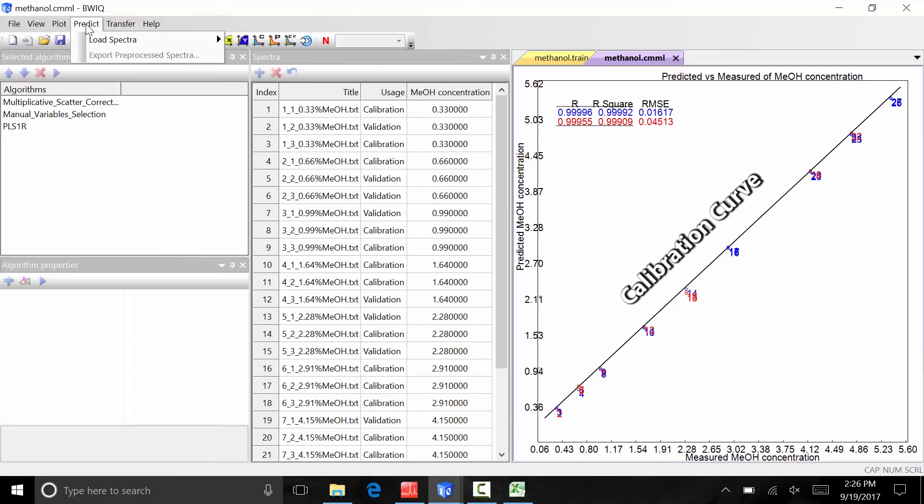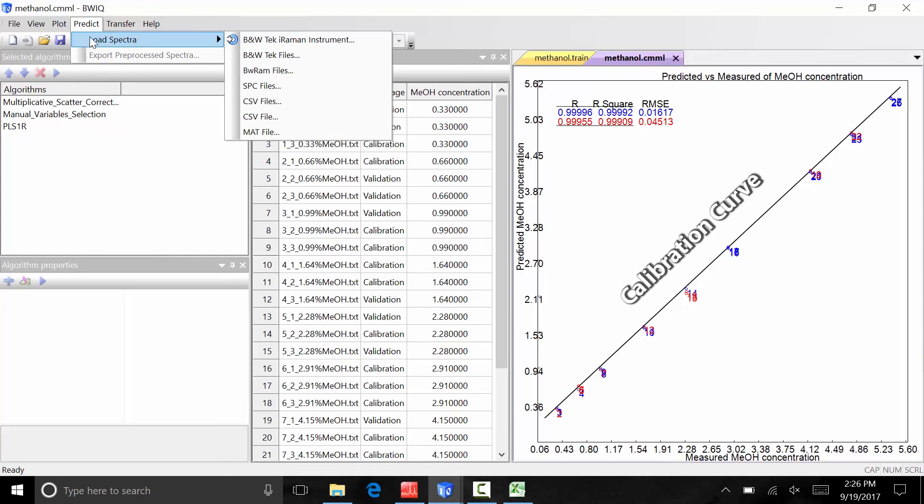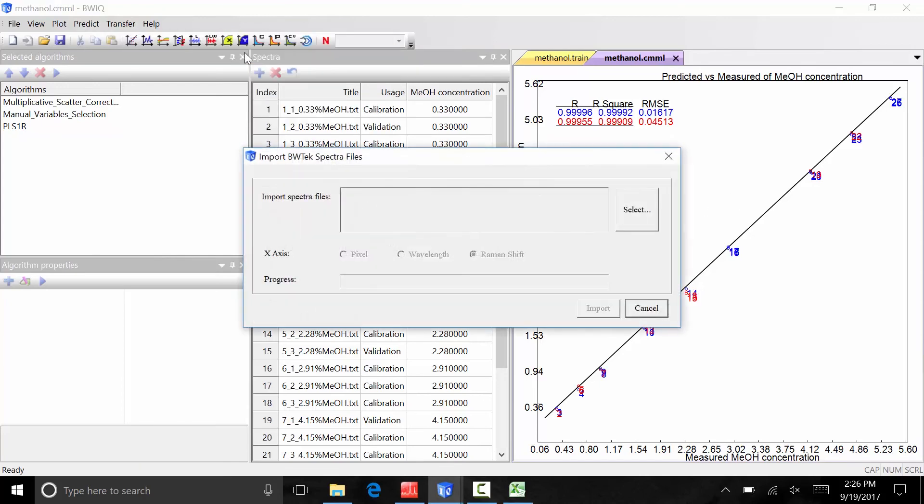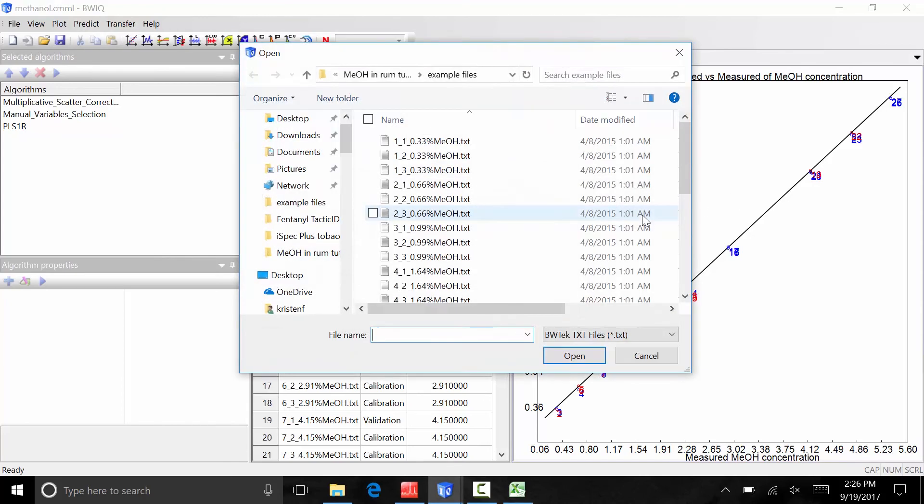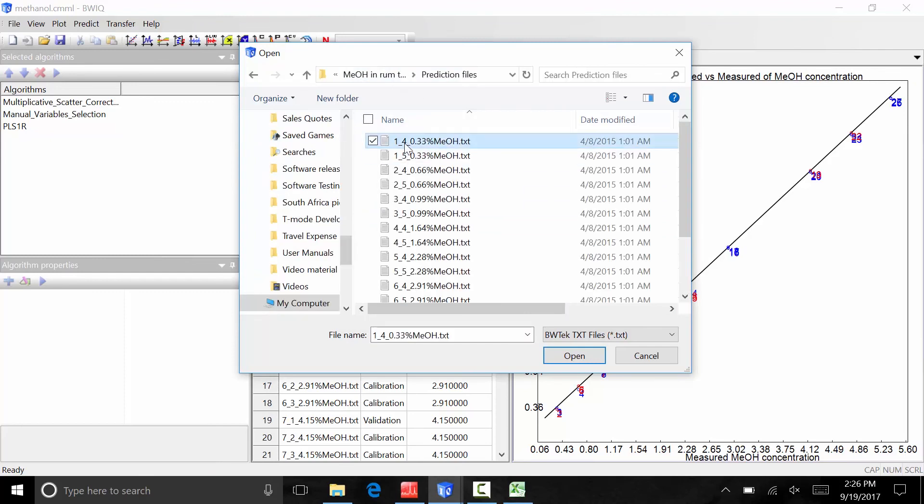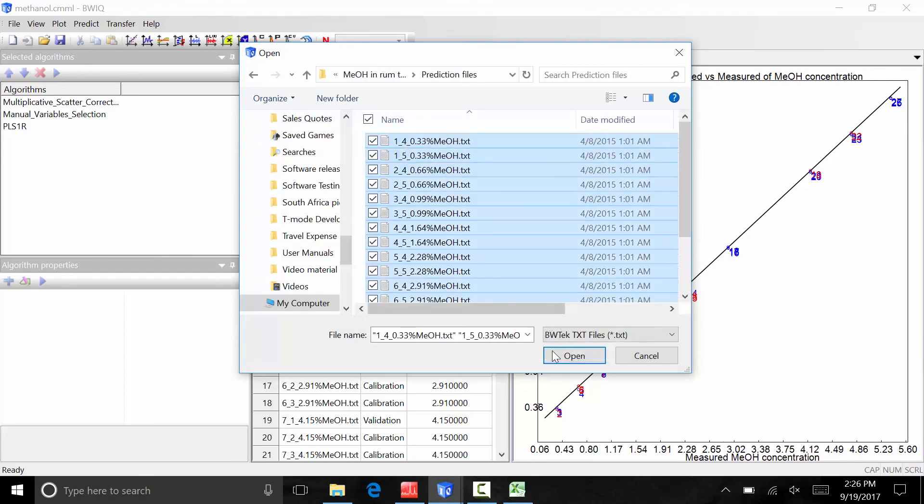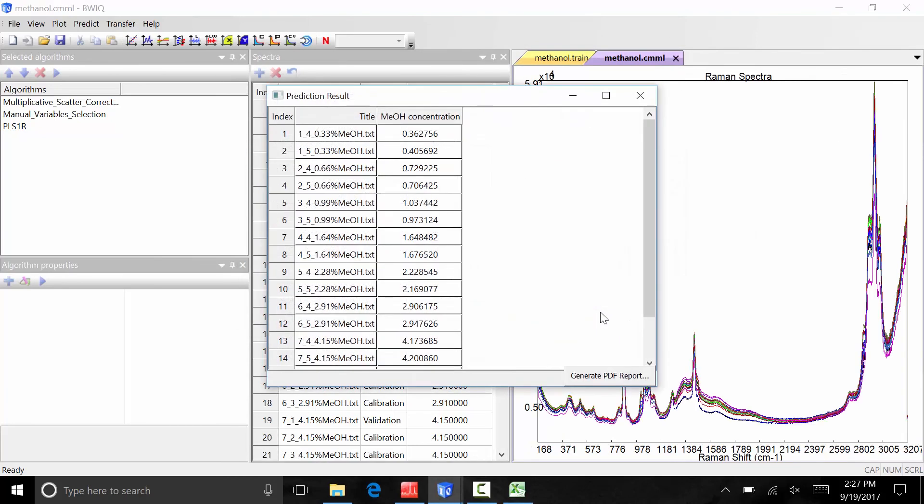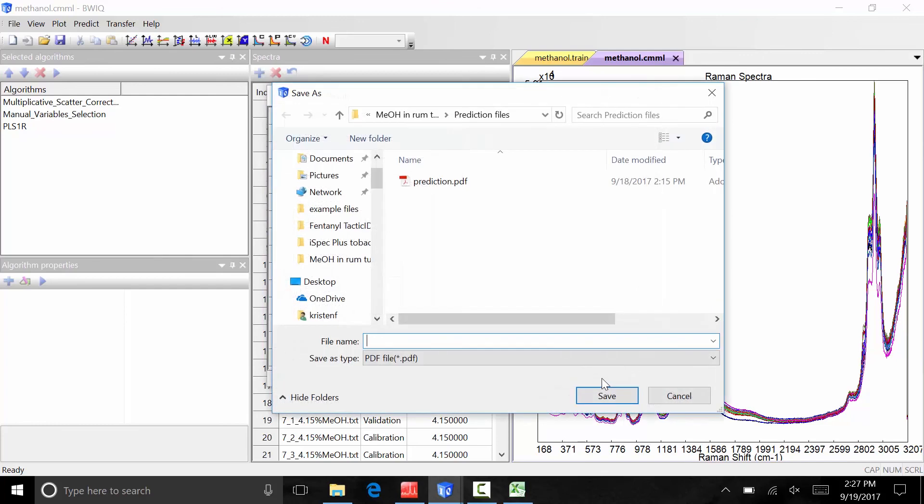Under predict, select load spectra. Locate the prediction files you are looking to analyze in the correct file format. Import the prediction files into BWIQ. The window that appears lists the predictive data file names in the left column and the prediction values in the right column. Under generate pdf report, you can also save a pdf report which details the method parameters and the prediction values.